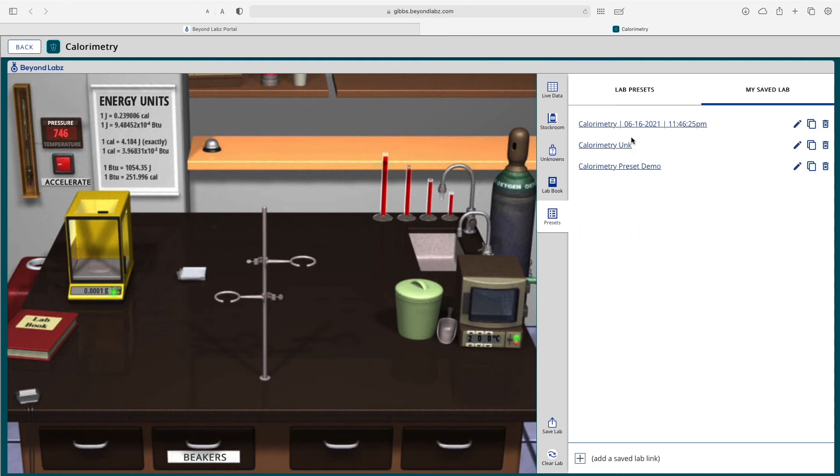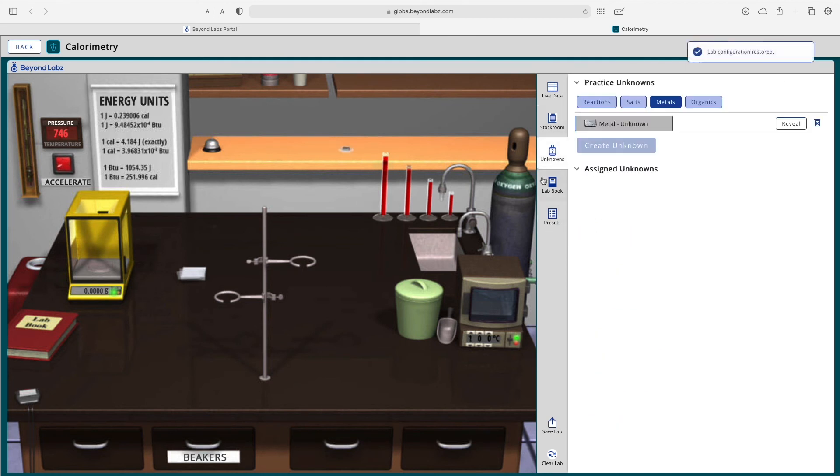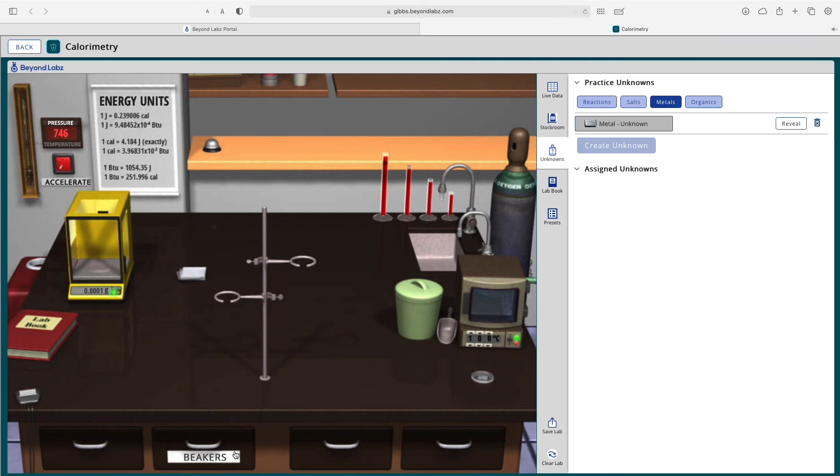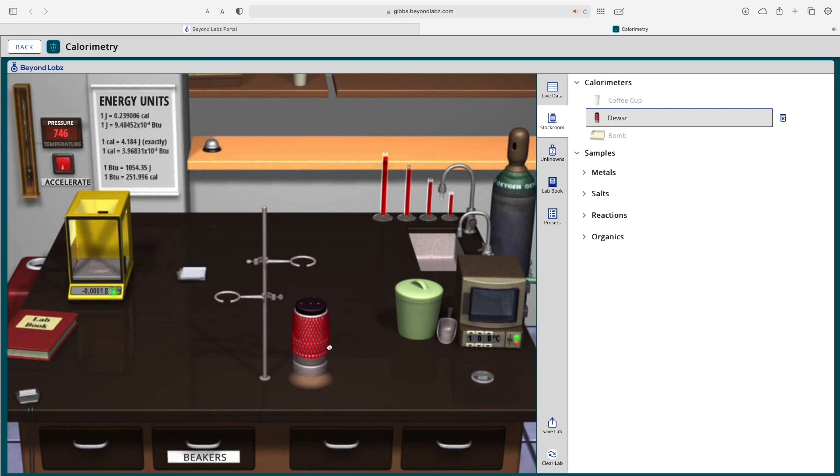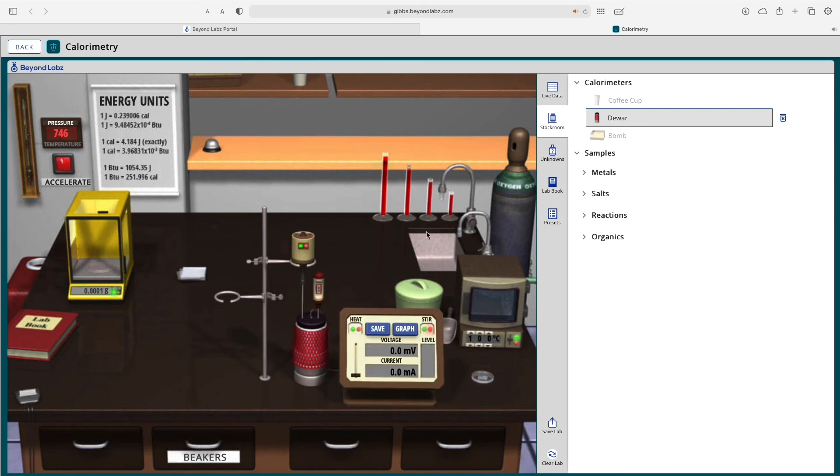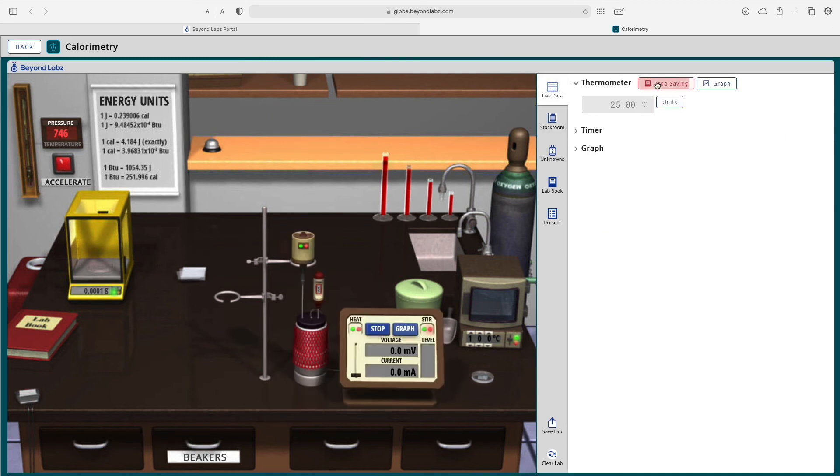So for example, if I wanted to do a preset with a calorimetry unknown, here I have this metal. Let's go ahead and get a Dewar. And just to show you how the lab book might work with my live data, I can click save data.